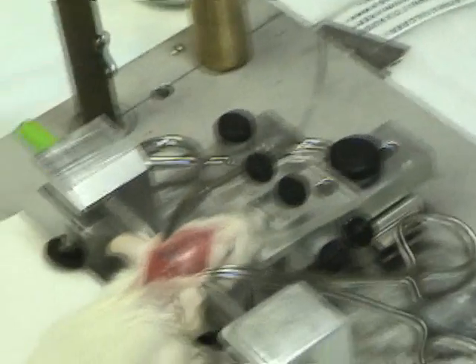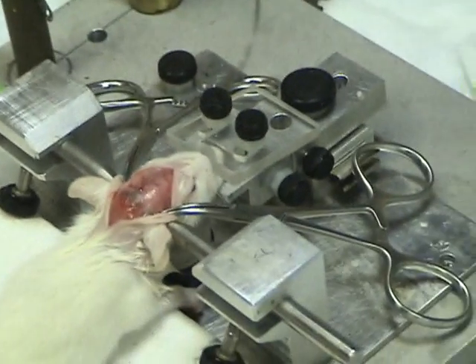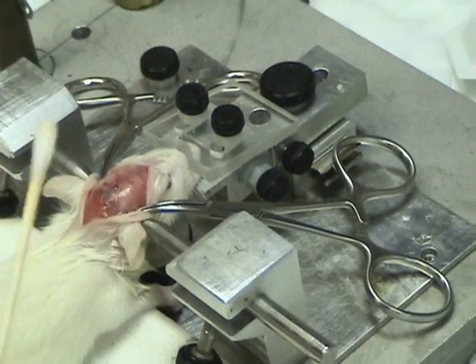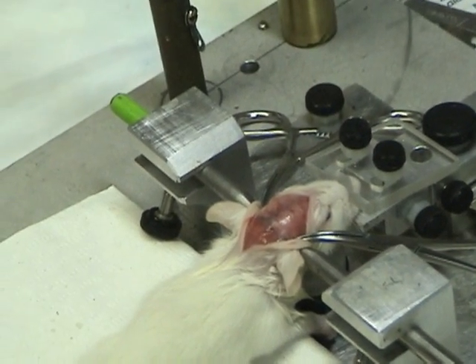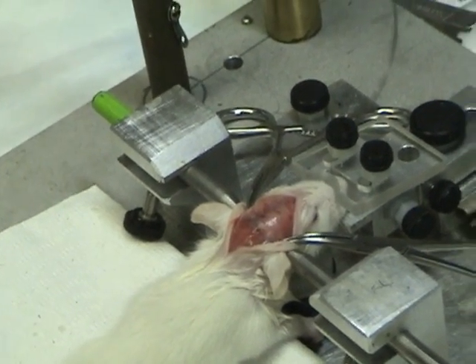How long do they survive with those leads after the surgery? One hour or one and a half hour? No, no — how long can they live after that? Like a few days, a week? Forever. Forever. So it's nothing.